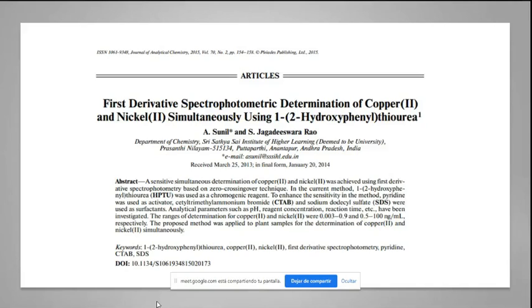And after that, to get the reactions a little bit faster, to use a little bit less time, they used some surfactants. So surfactants are just tensioactive agents. And what they do is they break the surface tension of the solvent, which in this case would be water, since we're talking about aqueous solutions. And they will act kind of like a soap. They will make some micelles in the water.